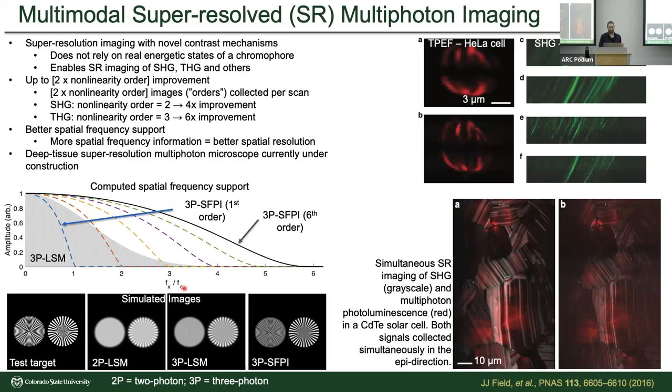So I bring this up as an example to say this is something that exists in the lab. We can incorporate it into the new microscope as well. So if there's some application space where you can think of that super resolution is critical for your work, we're happy to try to incorporate this as well.